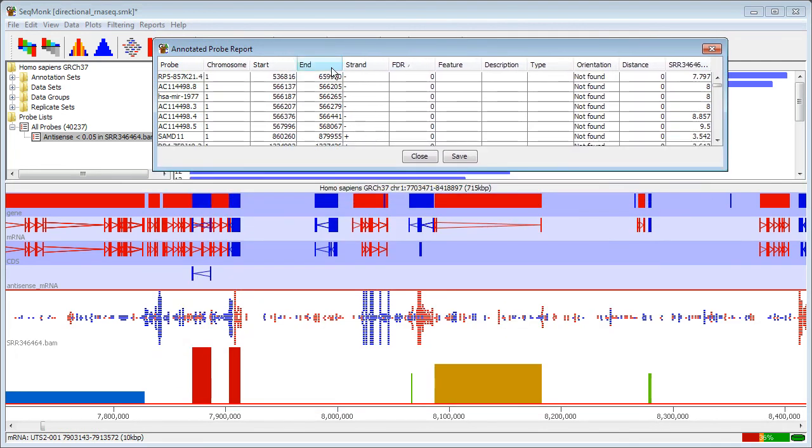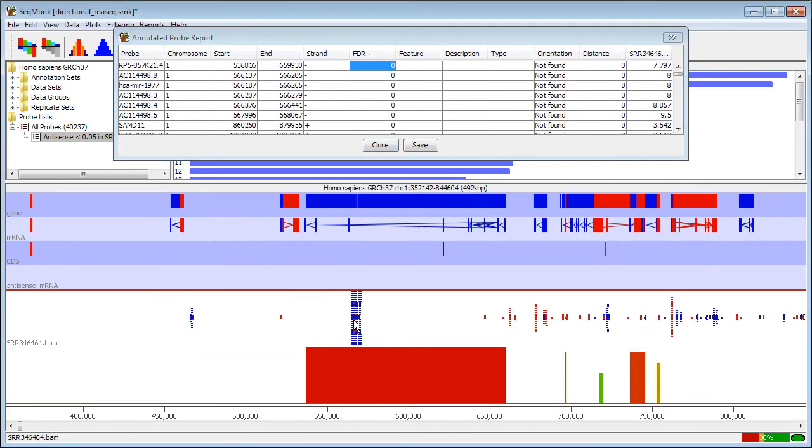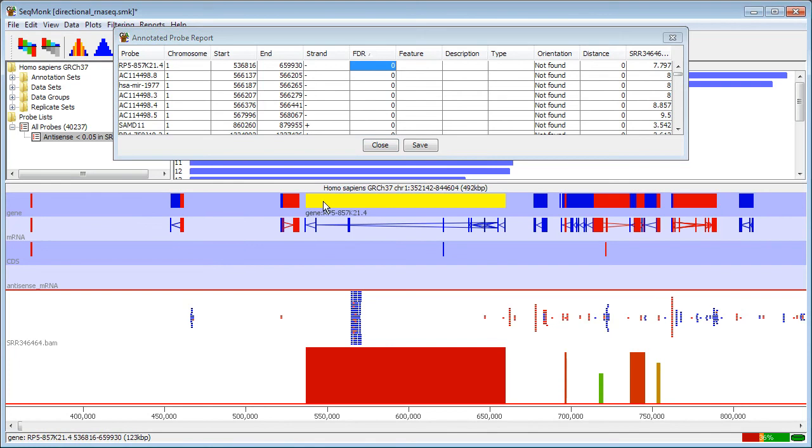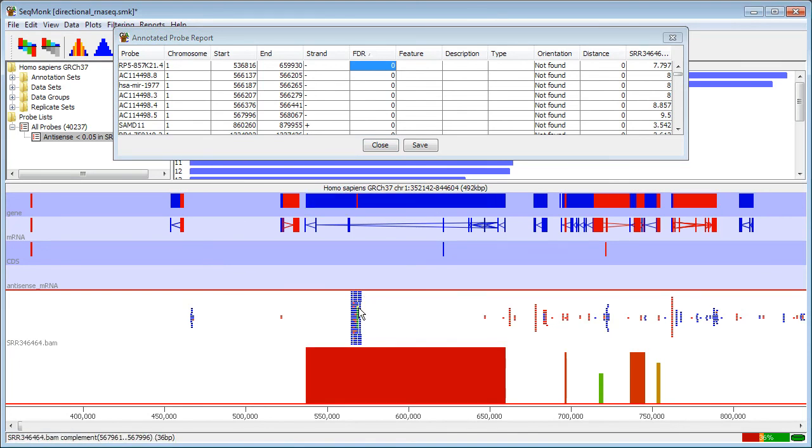I can see that I have a set of hits now, and if I look at these I should be able to see that in this case here I have a reverse gene with a set of reverse reads, which would be antisense transcription because this is an opposing library.